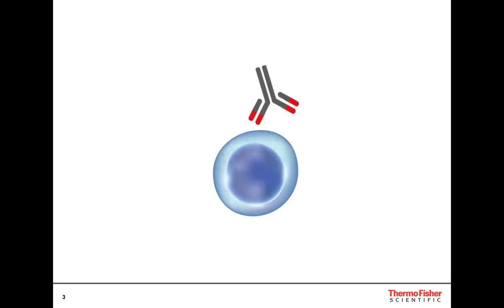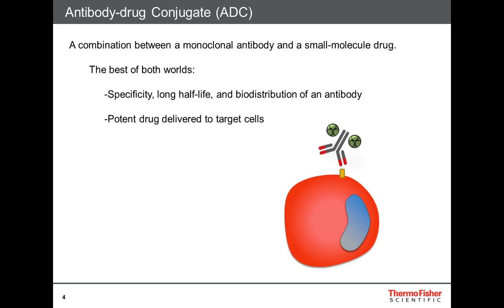And at a basic level, much of the work we do and much of the work in industry and in academia right now is based on this interaction of an antibody and a cell and how they interact in various ways, whether that's by binding or by the antibody after binding having some modulatory effect on the cells. Now, an enormous amount of energy and resources is focused on this simple interaction. Today we'll look at how we can go one step beyond an antibody binding to a cell and look at how we can weaponize that antibody to create an antibody-drug conjugate.